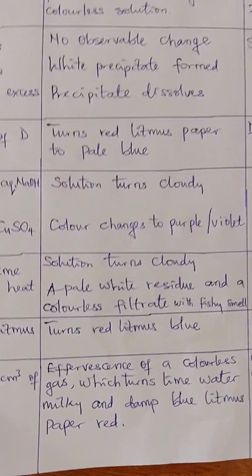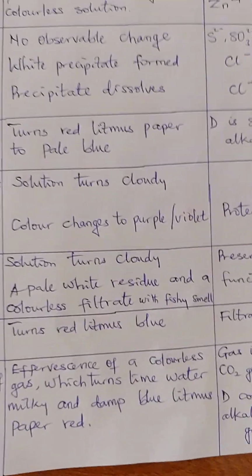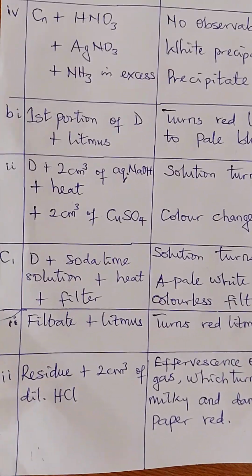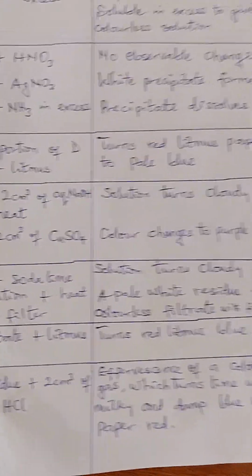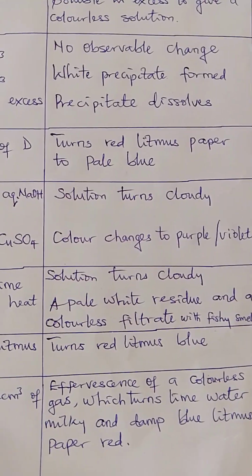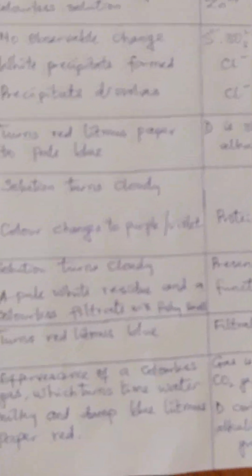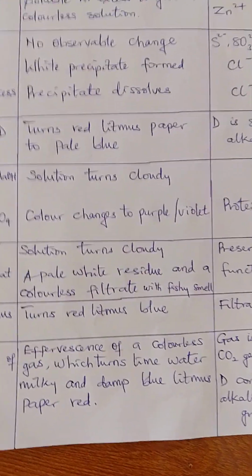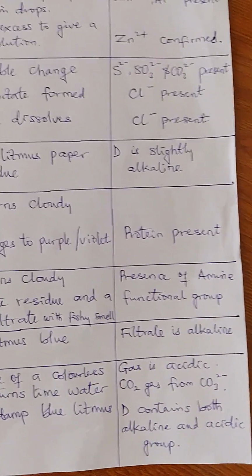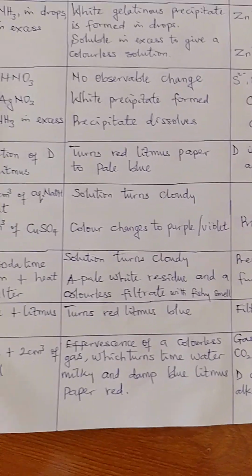If you do that and the solution turns cloudy, then you filter, you are going to get a pale white residue and a colorless filtrate, and that colorless filtrate has a fishy smell. That means a smell like fish. What that confirms is the presence of an amine functional group.